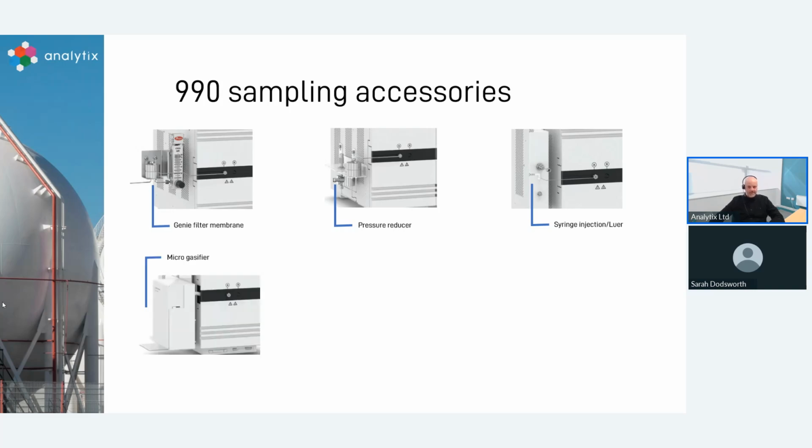We've got a micro gasifier to work with LPG, LNG samples. So this is a pressure drop down system, so it can handle the higher temperatures, higher pressures, condensing samples, and then it'll deliver it at the required level to the analyzer.